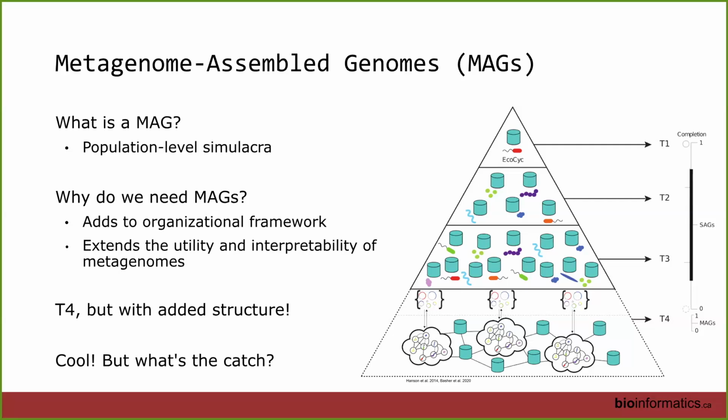And in order to do that, we need some type of organizational framework. It lets us further extend the metagenomic annotations that we have already done. So you can start to associate those individual annotations that you got from, say, Kraken with each other to then start to build an idea of what these populations are capable of, potentially. And if you want, you could do metatranscriptomics and then show what they are actually trying to do. So that's very, very important. It's essentially metagenome with more structure.